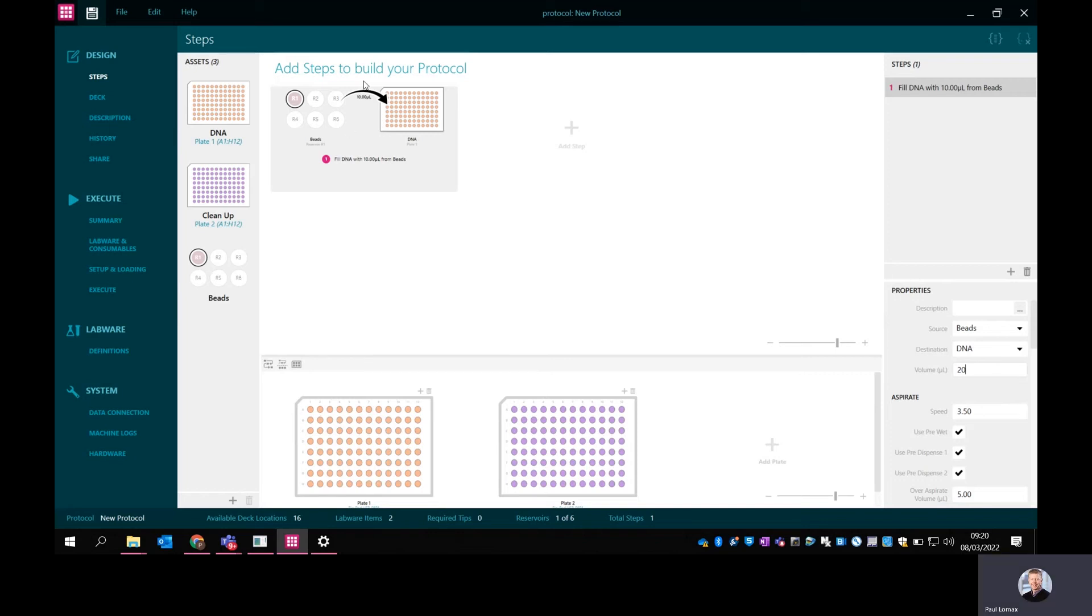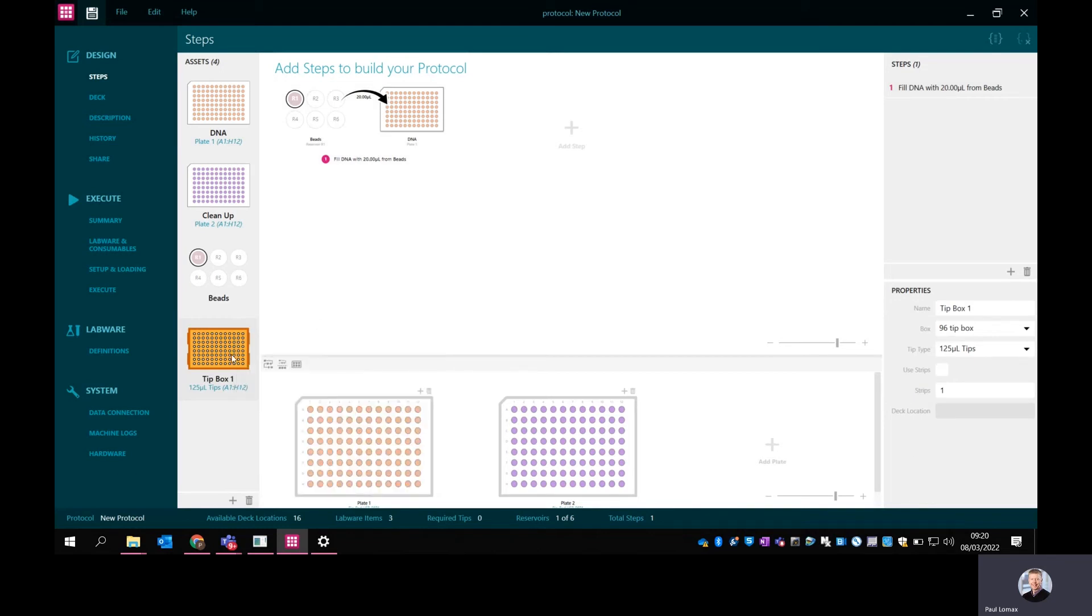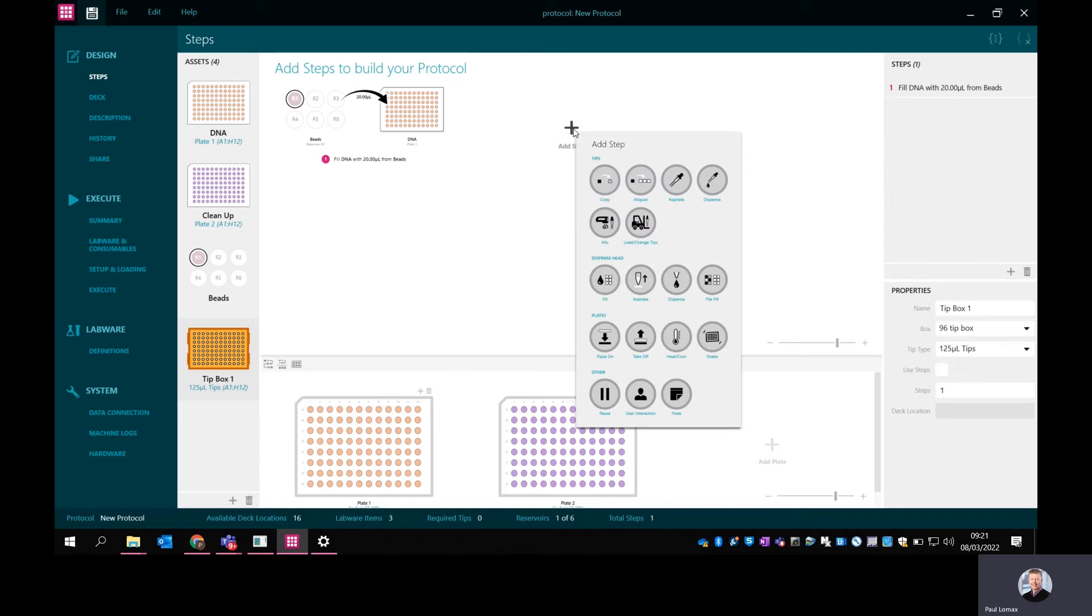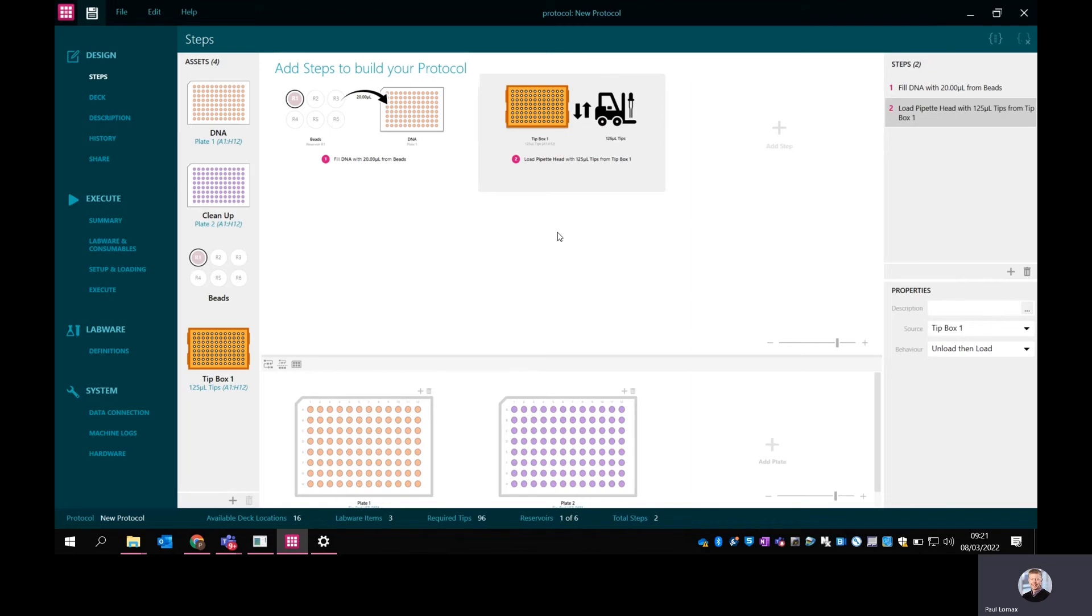I've got my dispense of beads to the DNA plate. Now I want to do a mix. I'm going to do that with the pipetting head with some tips. First I'm going to add some tips. Let's put a tip box in. The default that's dropped in here is the 96. On the right here, I could change this - I could choose the 384 or 96 and what volume. But I'm going to stick with the 125 microliter 96 that is there as standard. I'm going to put the tips on the head, so I'm going to load the tips. I simply drag that tip box in to show that I'm loading it onto the head.